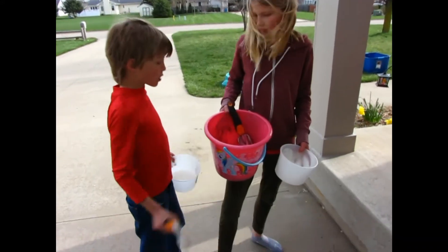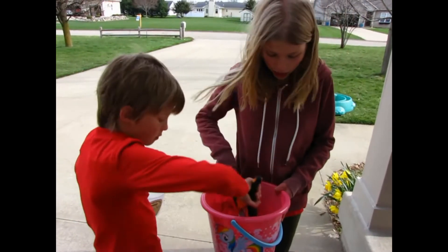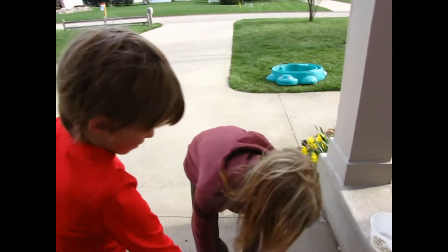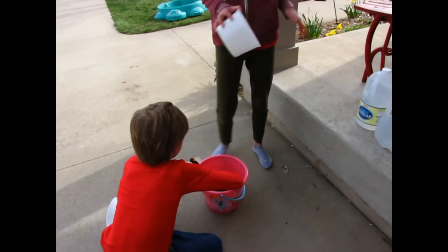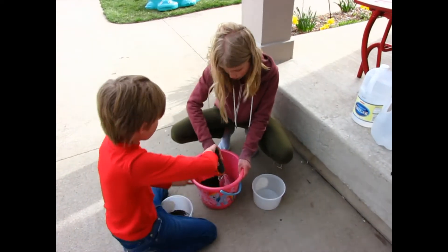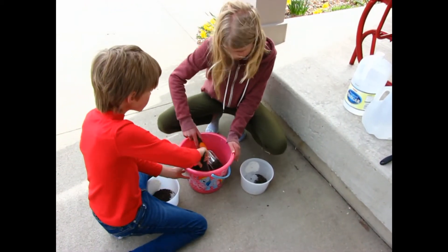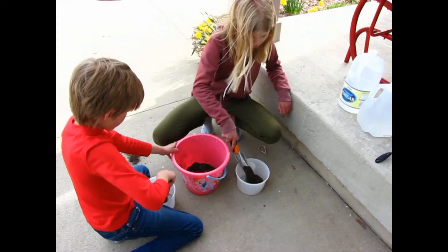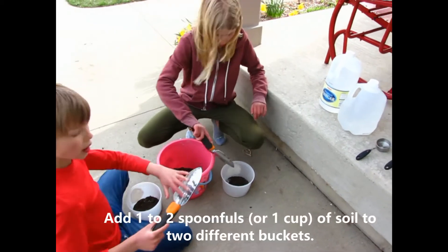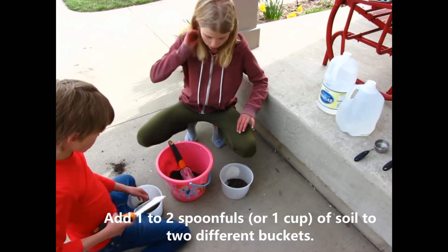Now we're ready to do our experiment. We're going to take some soil and set it down, putting it into two different tubs for the two different experiments. Probably about one full of these and a little bit more — looks like about one cup.